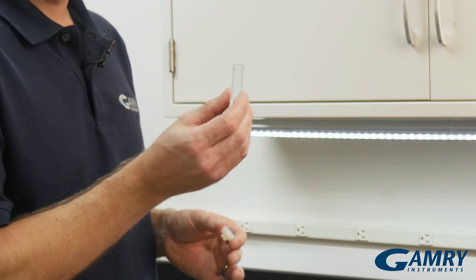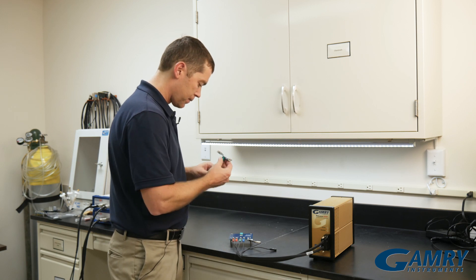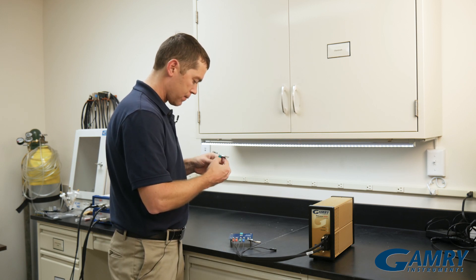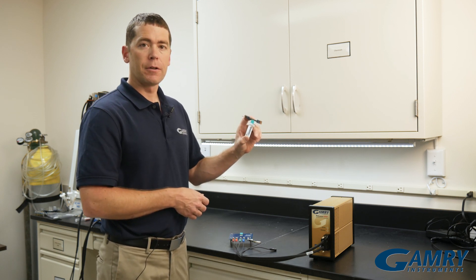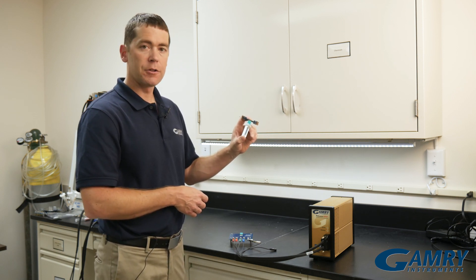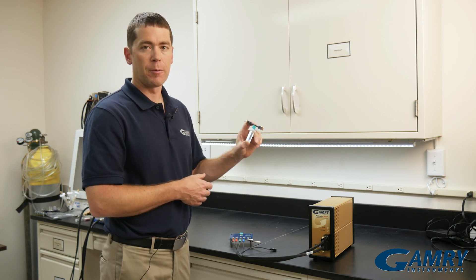Then we have this little cap that's meant to fit on a standard cuvette. We push that down inside, and now we have a regular cell for slightly larger experiments, perhaps a stripping voltammetry experiment, or so forth.